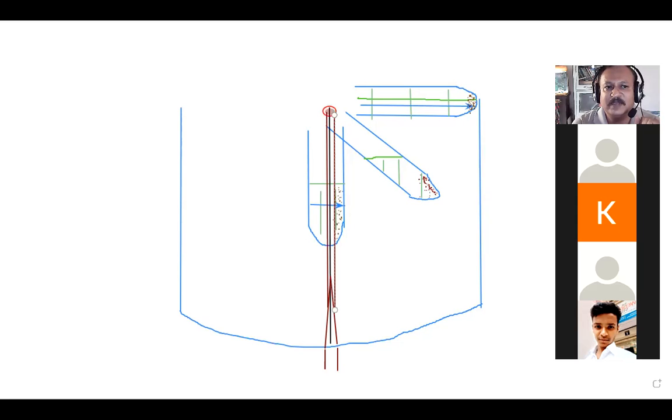In the earlier diagram, I think we have already seen this. Let me show you. Yeah, these are the slots in which the tubes are kept. Either these slots are vertical inside or they are at an angle. Can you see these holes? They are actually cylindrical spaces in which the tubes are kept. I have shown this line here. The line indicates the direction of the tube holders, right? So maybe 1, 2, 3, 4, 5, 6, 7, 8. 8 tube holders are there in the rotor.